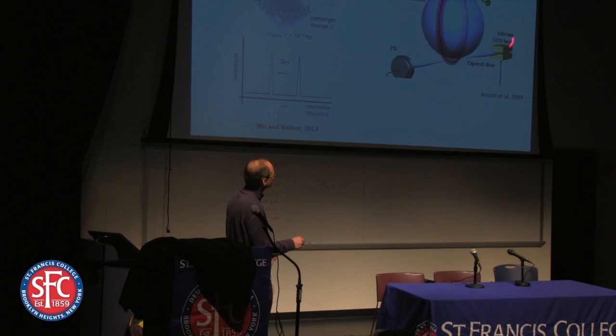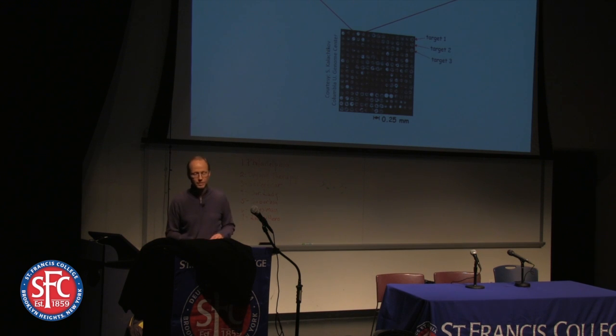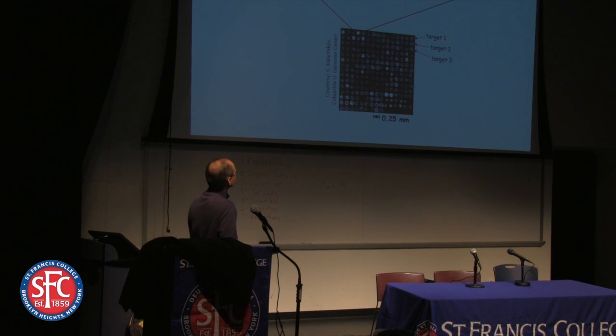Then you take a distributed feedback laser, which is an affordable, wavelength-scanning laser, and by scanning the wavelength, you can see which wavelengths are in resonance. I wanted to spend a little time on that, because that's a very sensitive label-free method that's increasingly getting used for biosensing applications.